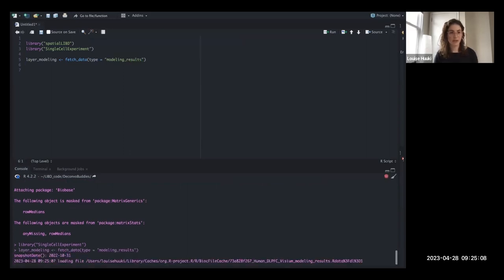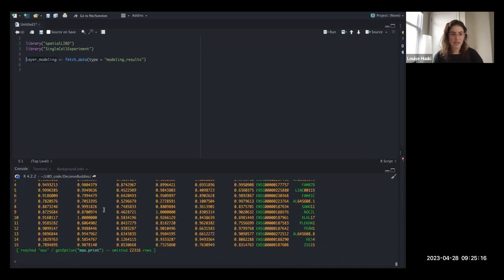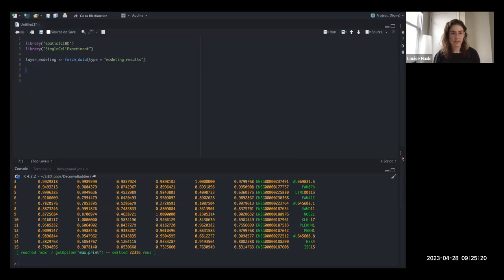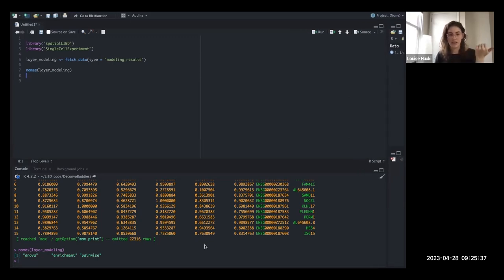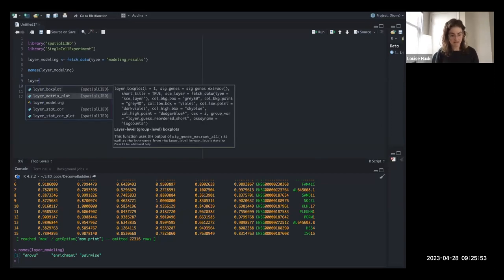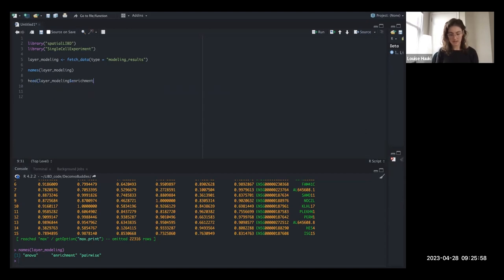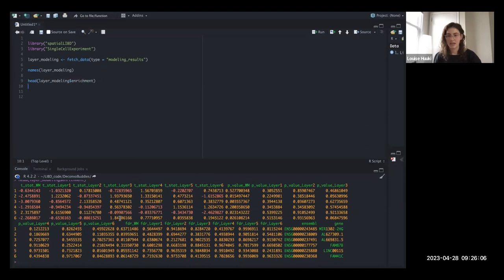We need two data sets: the reference data set that we're going to map to, and the query data. We're going to use the original 12-sample set with the layers as our reference. We'll use the fetch_data function out of spatialLIBD to load that data. The modeling_results object contains three different models — it has all the differential expression results from that first study. Specifically it has an ANOVA, enrichment, and pairwise differential expression across all the different layers.